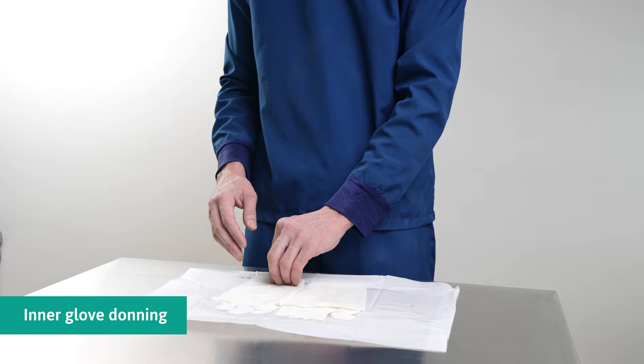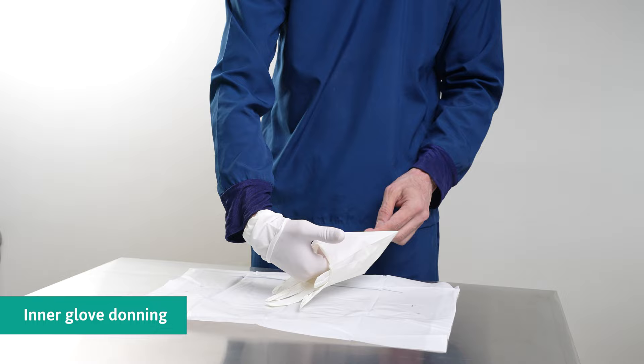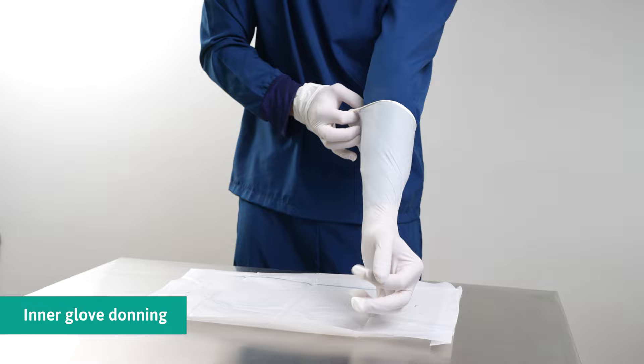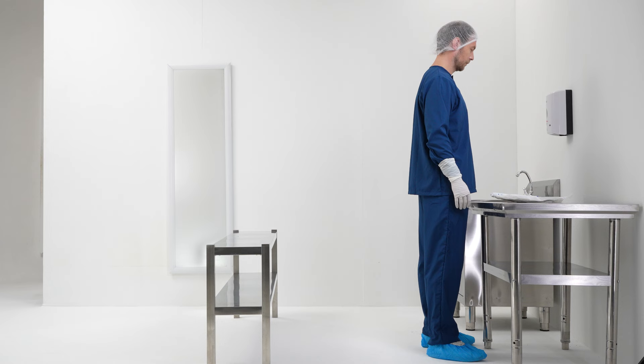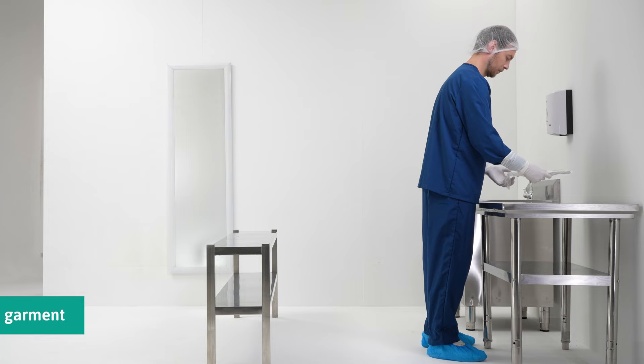Grip firmly at the folded cuff and slide the other hand into the glove. Pull the folded cuff towards the wrist. Slip the fingers of the gloved hand into the folded pocket of the folded cuff, slide the other hand into the glove, and unfold the cuff over the sleeve using the gloved hand. Unfold the cuff until it overlaps the sleeve. Disinfect the gloves prior to retrieving the sterile contents from the packaging, then retrieve the coverall from the package.